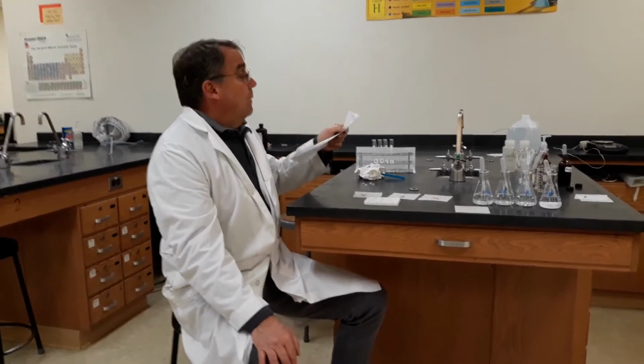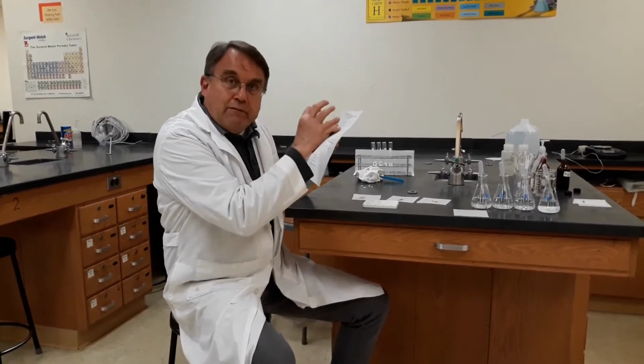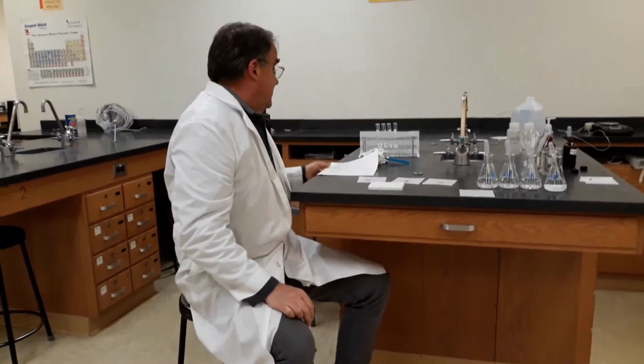Okay, so we're going to skip section E, the effects on organic substances, and go right to section F. Section E takes a while for it to have its effects, so we're going to do that last.